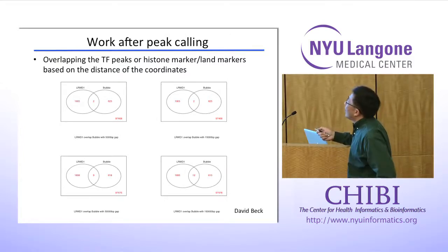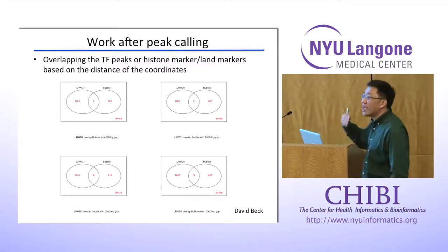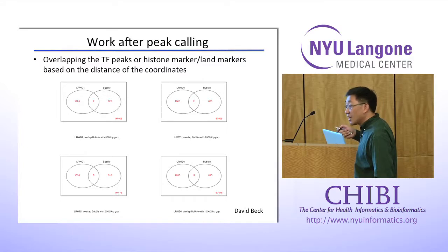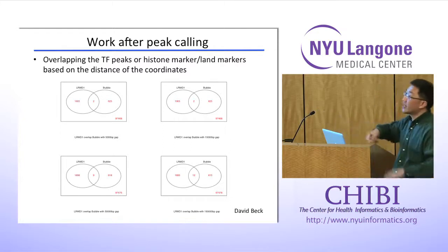they are. In this study, we would like to know about the DNA replication forks. If this protein has something to do with the DNA replication forks, if it is near or overlapped, we will probably have some idea this protein has something to do with DNA replication. But functionally, we don't know. This gives you some idea physically how they interact.